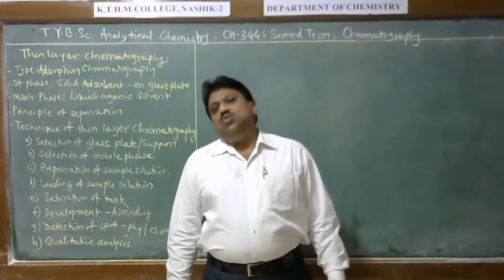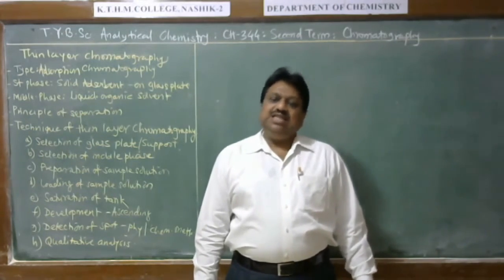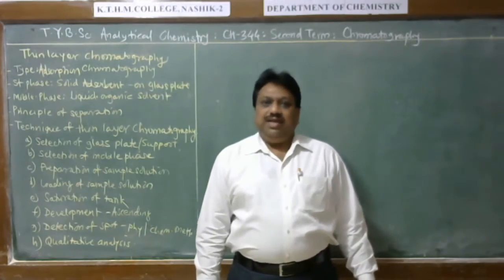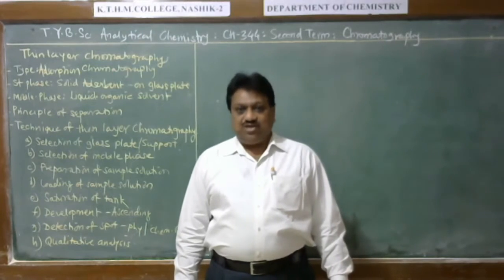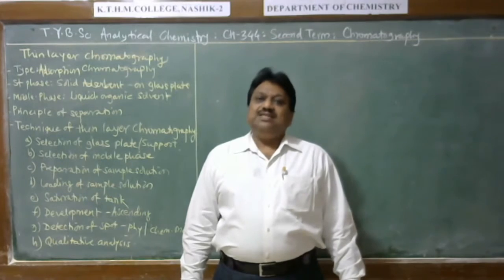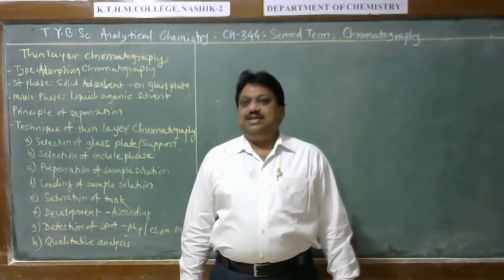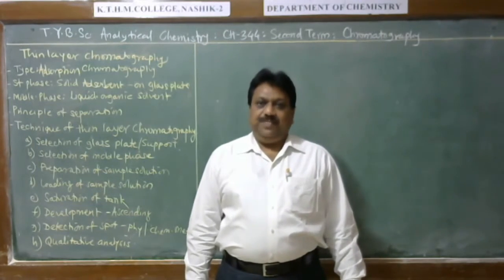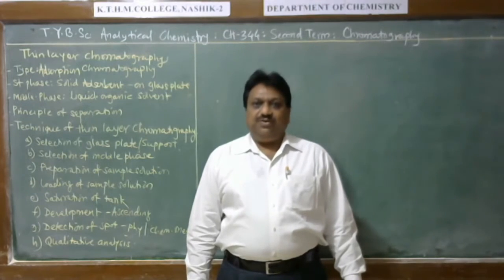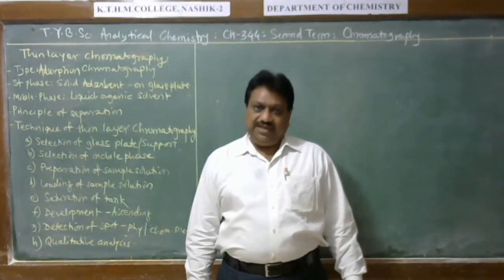Now we discuss how this thin layer chromatography works. Basically, thin layer chromatography is an adsorption type of chromatography in which the stationary phase is a solid adsorbent having specific functional groups, and the mobile phase is a liquid having the capacity to dissolve the sample components present in the mixture. Therefore, a sample containing different components is loaded or applied to one end of this adsorbent material.